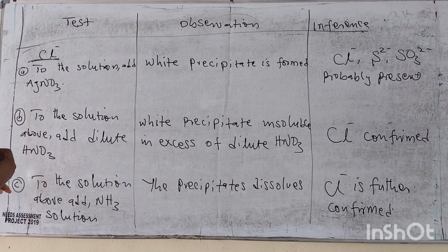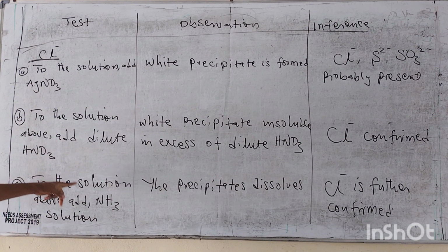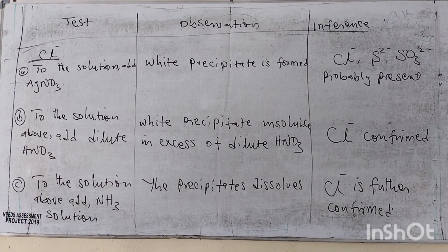Now that is not all. We still proceed to the solution above. We add ammonia solution to it.